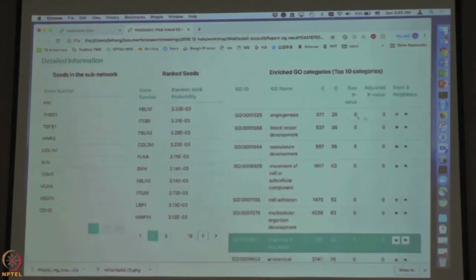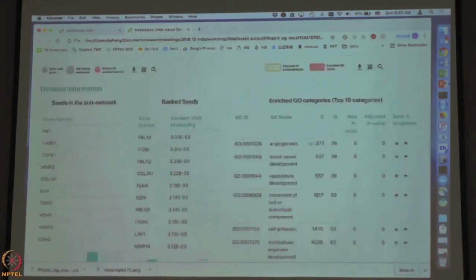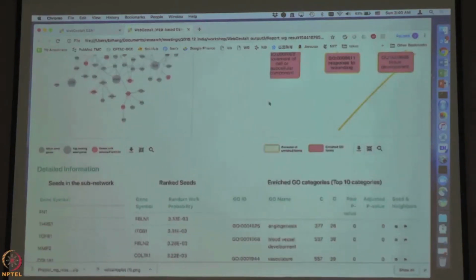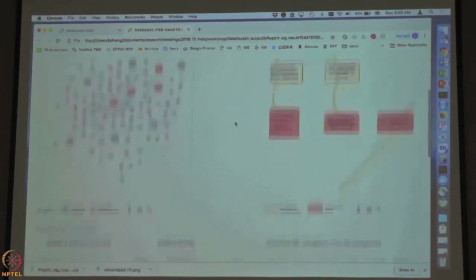This is a gene ontology enrichment analysis result for the network. So basically the typical gene ontology overrepresentation analysis report result, similar to the ORA analysis, but focusing on the genes in the network and using the gene ontology biological process for evaluation.